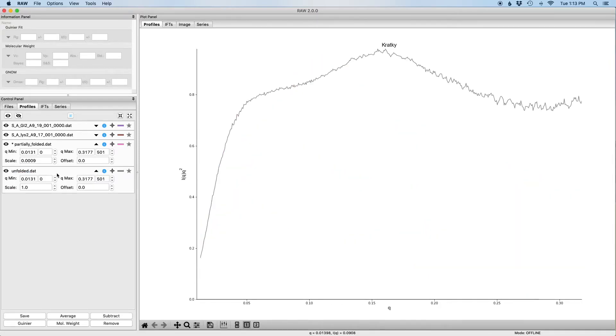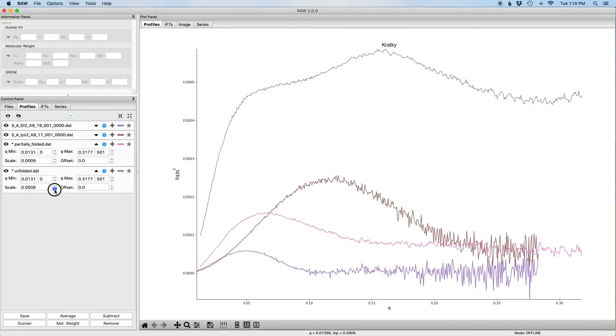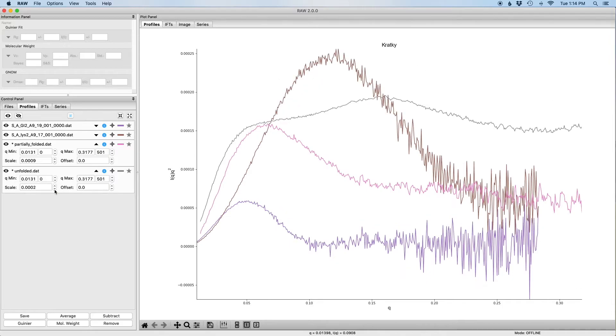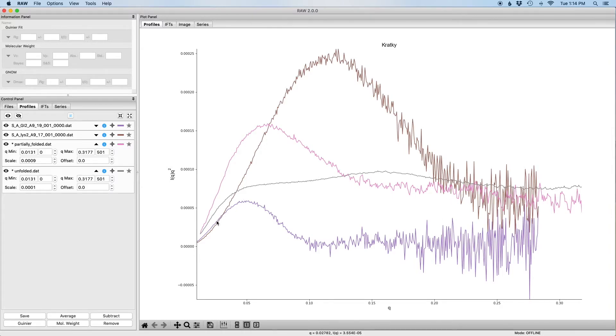I'm going to repeat this for the unfolded data. I'm going to show it on the plot. I'm going to expand it and I'm going to scale it down until it's on the same scale as the others. So now all the data is on the same scale.